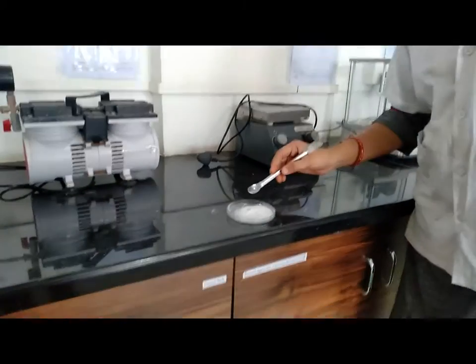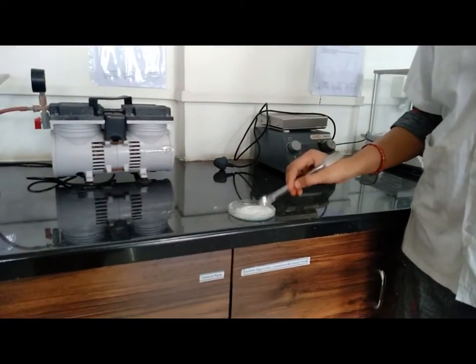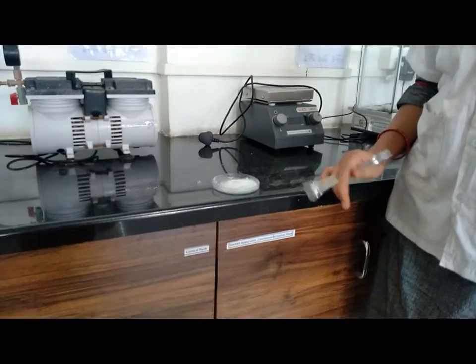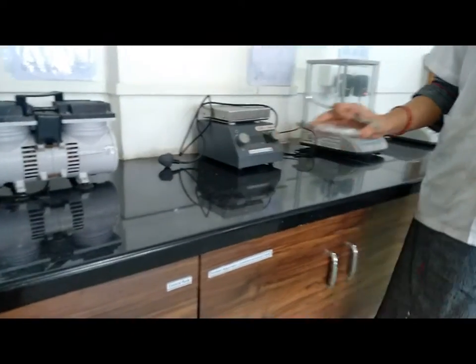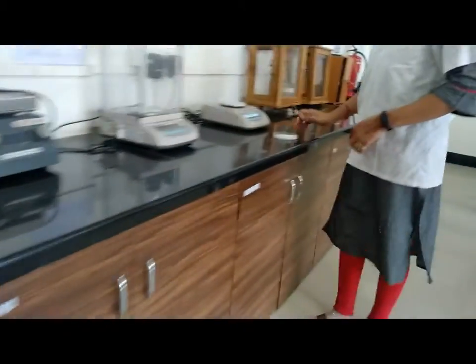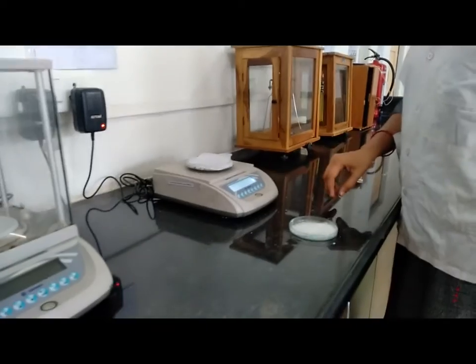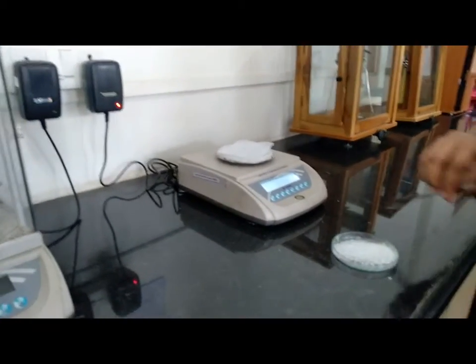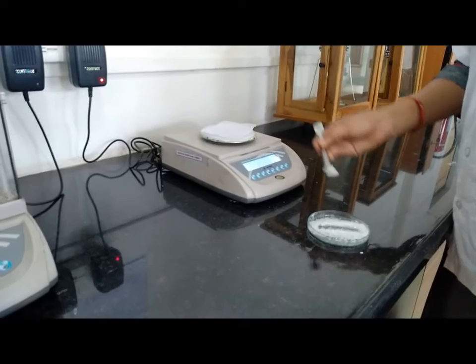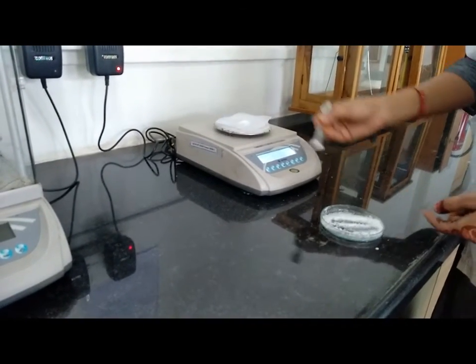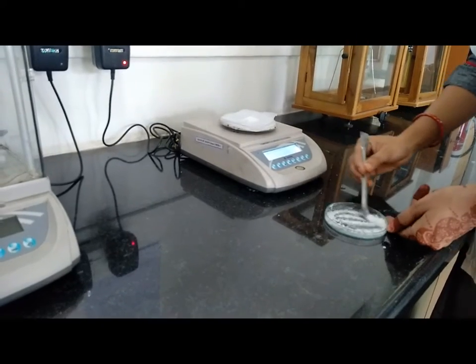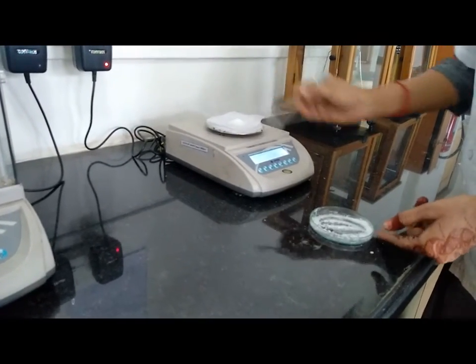After drying at 105 degrees Celsius in the oven, we get such a type of white crystalline powder. Now we have to weigh this powder so that we can calculate the yield.